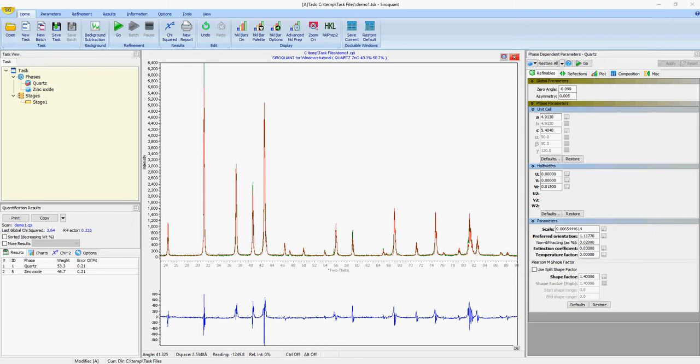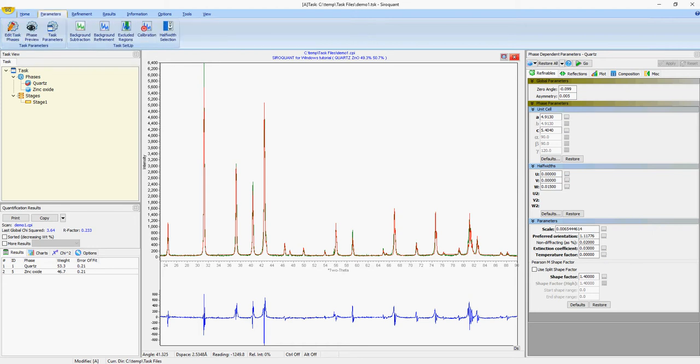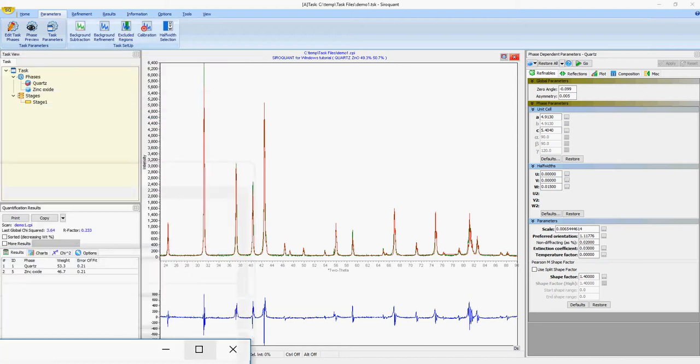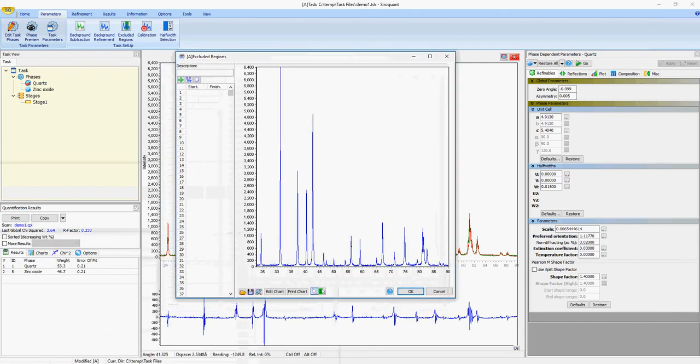Another feature to note is the ability to add excluded regions. So some instruments may have some artifacts that you want to exclude, or if you want to exclude the start or end of a scan because of the instrument background or something like that, you can also add an excluded region to your scan and that will exclude any region in the excluded region from the refinements, therefore not impacting the results.